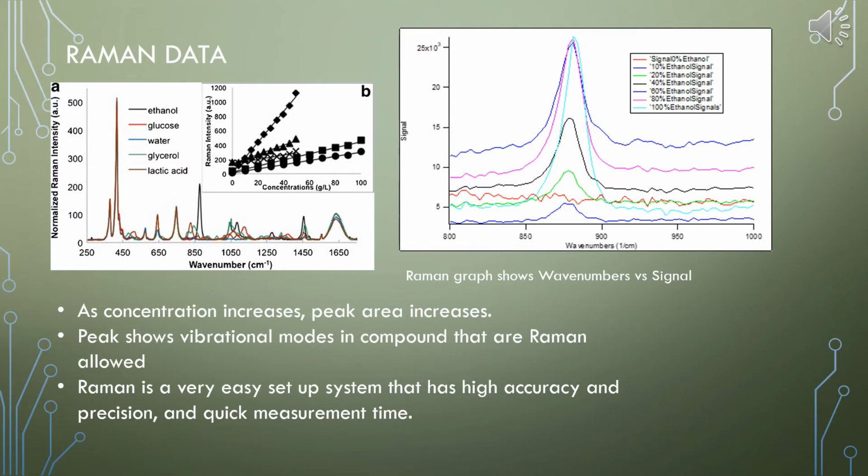Raman is efficient as it is very fast at measuring Raman spectrum. This allows us to measure multiple sets of data and average it out. The sample preparation is also very simple. The data that is collected is processed and plotted as wave number versus intensity.